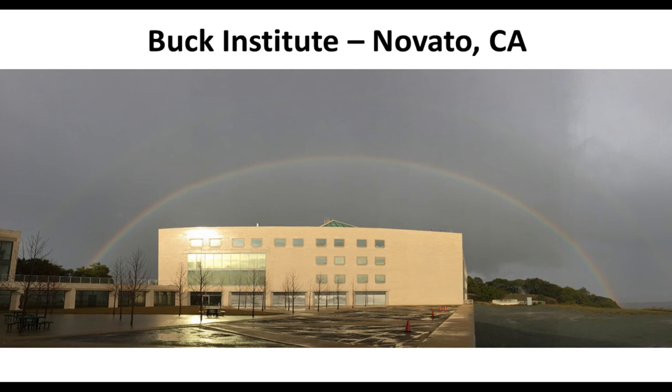Yes, so using these DIA workflows, we found that it has really improved our ability to identify the site of modification, because when people do data-dependent acquisition, what often may happen is that you trigger the MS-MS spectrum on one isoform, and then there's dynamic exclusion for that particular M/Z precursor ion. If one does use data-independent acquisition, everything will be monitored all the time, as that is the concept of data-independent acquisition. So that has helped greatly.